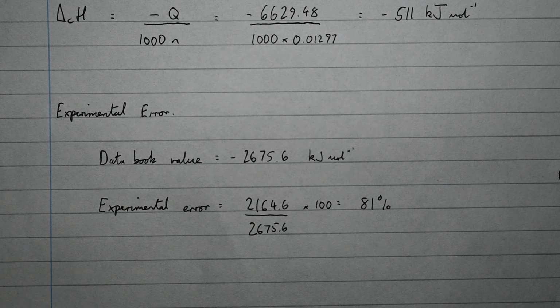So this experiment has shown you how you can measure a value for the enthalpy of combustion for a flammable liquid using a calorimetry experiment.